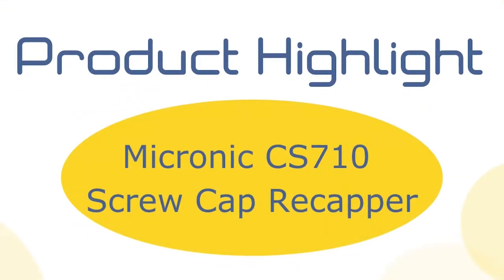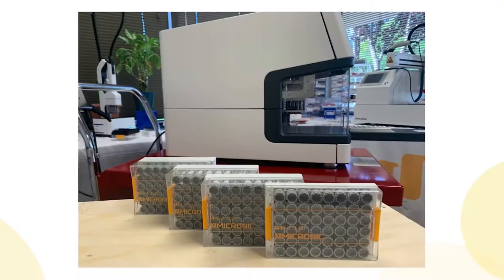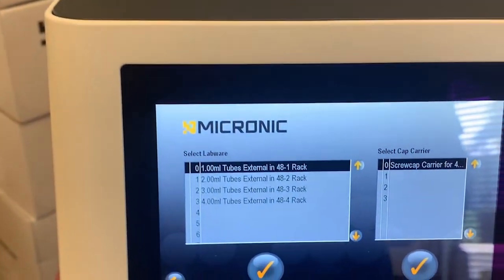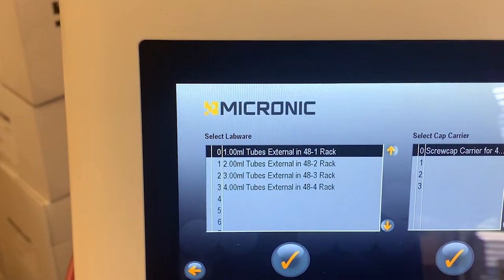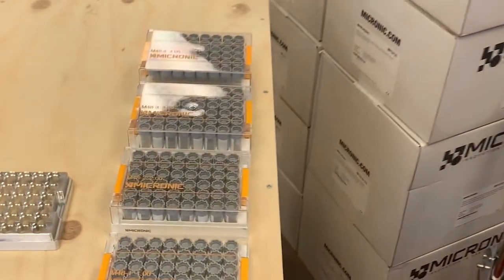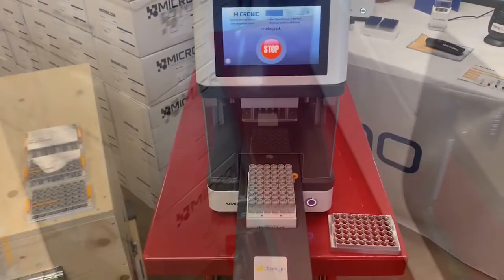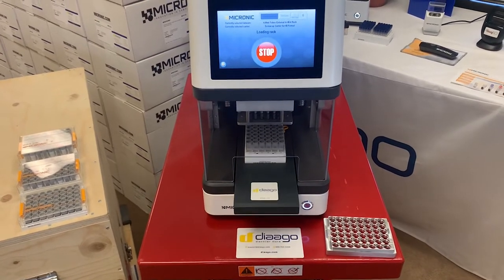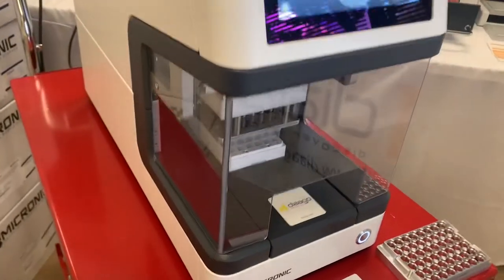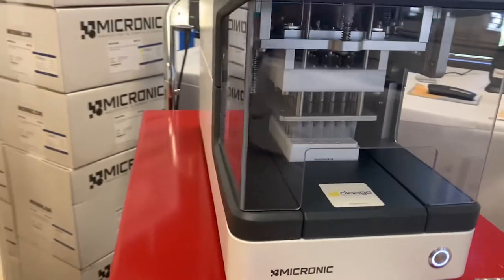Today's product highlight is for the CS710 Micronic 48 format for the external threaded version of the screw caps. As you can see here, there's a select menu where you can select the lab where you need to cap or decap. You have the 1 mil, 2 mil, 3 mil, and 4 mil external threaded versions. The CS710 usually takes about 28 seconds for a cycle of capping or decapping to do a full rack, whether it's a 24, 48, or 96 format.